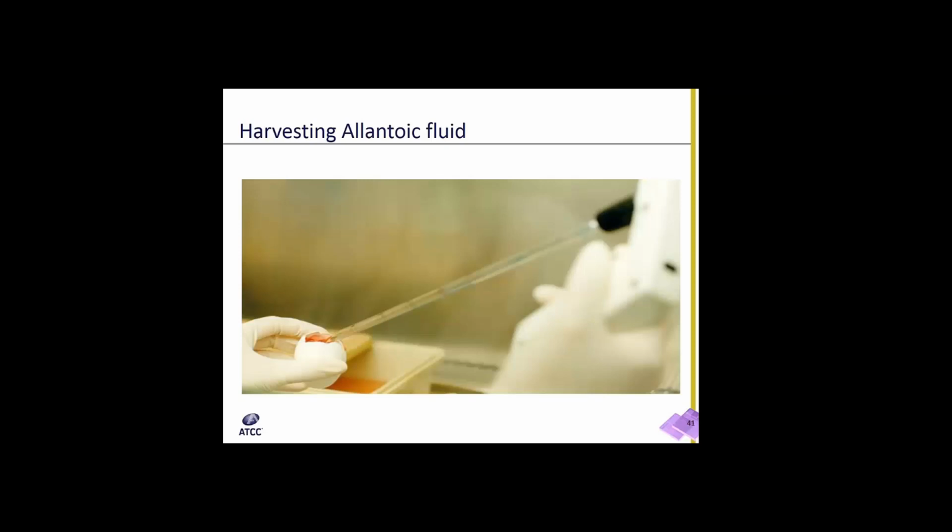After virus is harvested from eggs, it may be pooled, again leaving out anything you suspect of contamination. Eggs are treated as biohazard sharps. After harvest, eggs should be put in double-bagged biohazard waste inside a metal pan. It is also a good idea to keep these harvested eggs inside a refrigerator until they can be autoclaved.